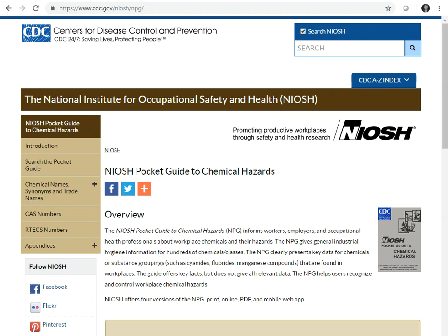NPG clearly presents data for chemicals or substance groupings such as cyanides. This is how you handle fluorides. This is what's special about manganese compounds, etc., that are found in workplaces. The guide offers key facts, but it does not give all relevant data.